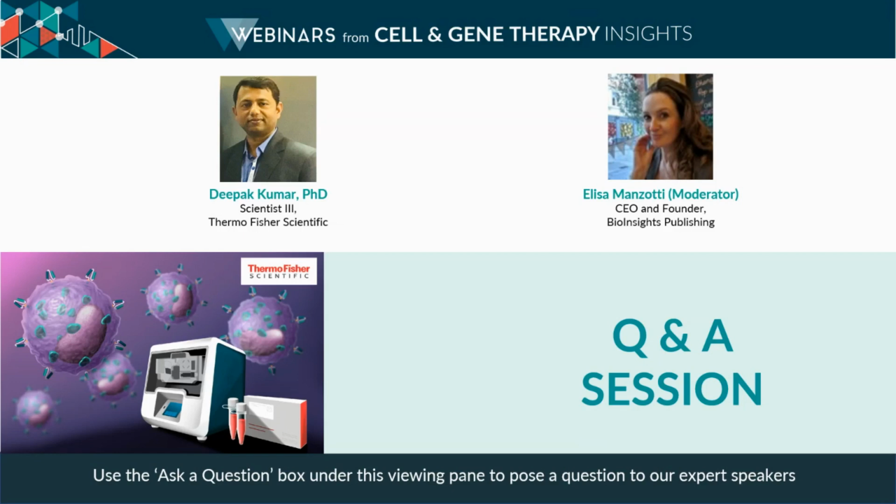Great, thank you. And then I've got another question. Can you expand NK cells from PBMCs without enrichment? We never tried that one, because PBMCs have lots of T cells. Definitely a great question. We can try that one, but we never tried it.